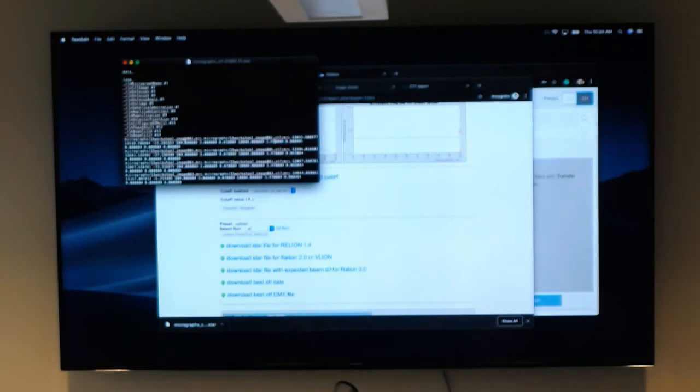So this is quite useful because you can begin processing, let's say, for example, in RELION and cryoSPARC, skipping a few steps because you already have motion corrected images. You have a list file with all the CTF information. It might have been pre-sorted to select the images that you would like. Also, you've done particle picking, object selection.